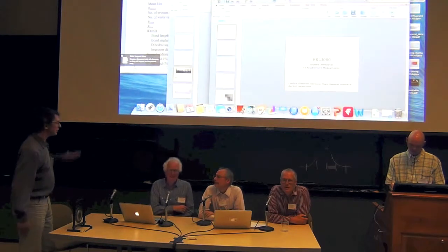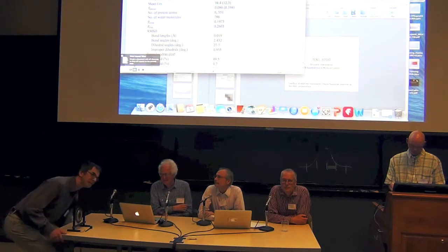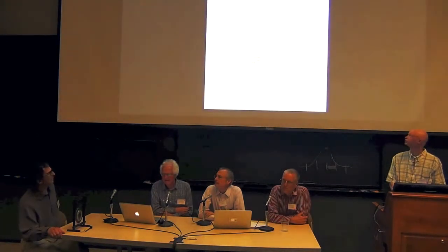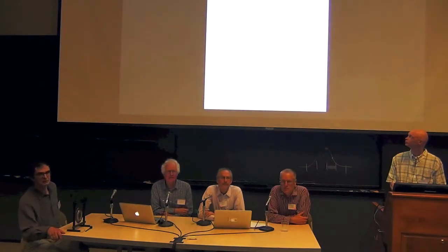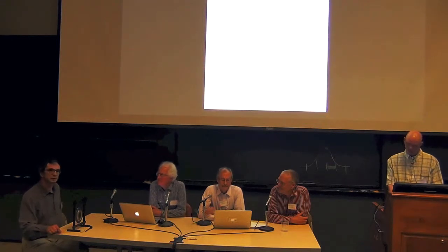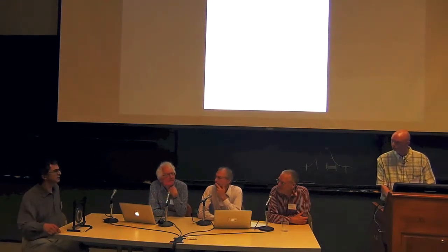But carrying this information, where we reach this point of experimental error being as big as model error, is going to be interesting to know. So where is this point? This depends, of course, on the resolution dependence of R-free, or even R-free defined.